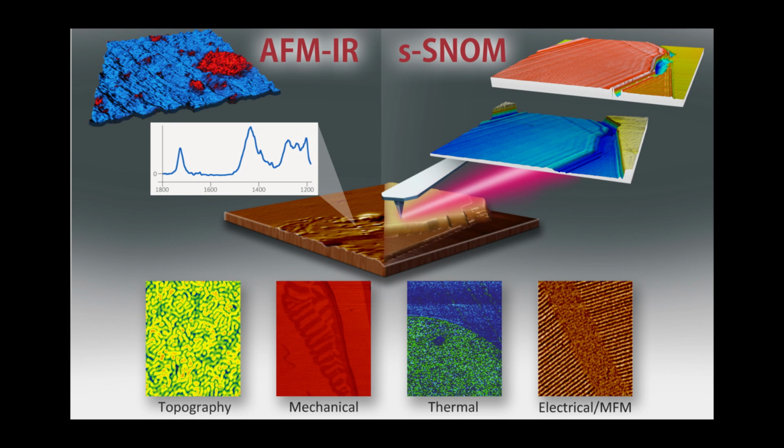And because of that, we can do certain types of measurements. For example, I showed the electrospun nanofibers, where we could distinguish the crystalline and amorphous phases of that material on the basis of those real absorption peak shifts.